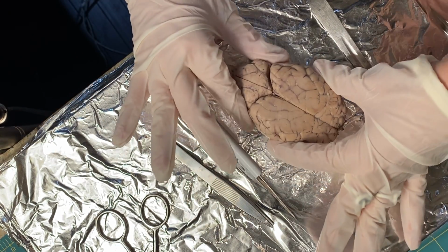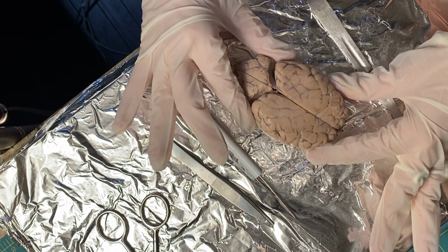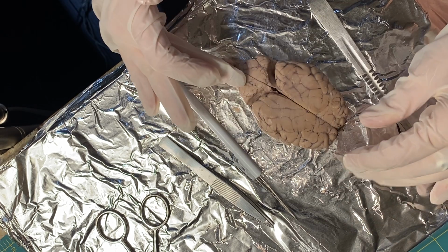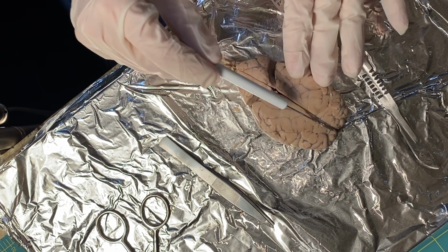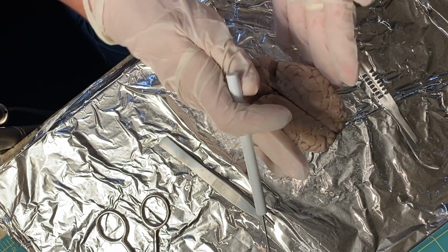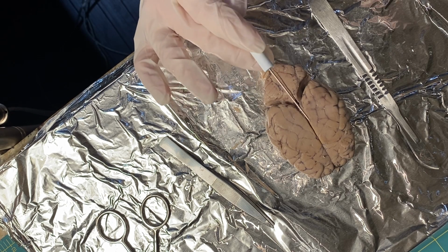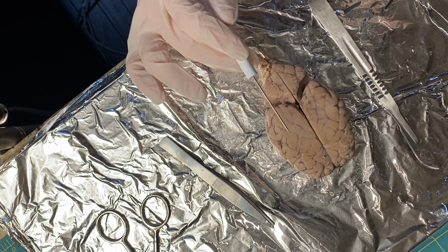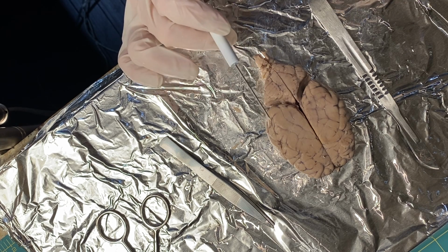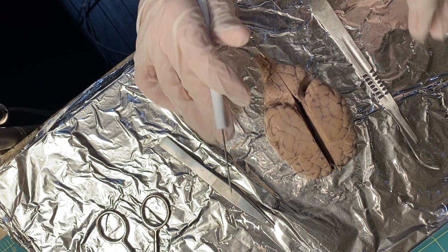So as you can see, I have already divided the left and right hemispheres of the cerebrum with a longitudinal fissure. This right here, longitudinal fissure, left and right brain hemispheres. So the left hemisphere is responsible for analytical thoughts, language, and reasoning. And the right hemisphere is responsible for creativity, intelligence, and insight.